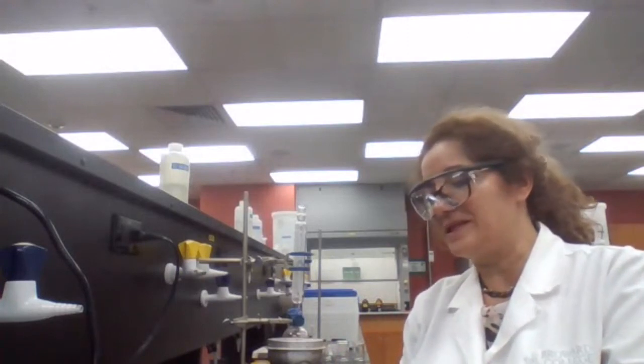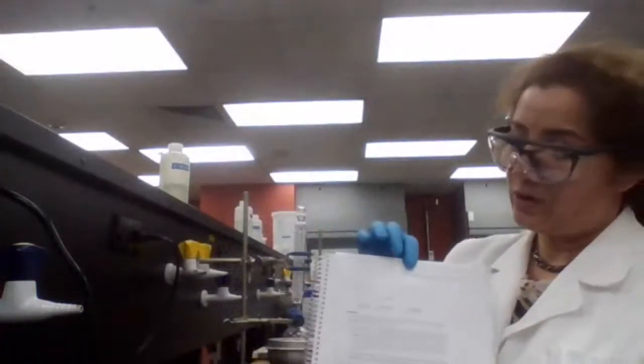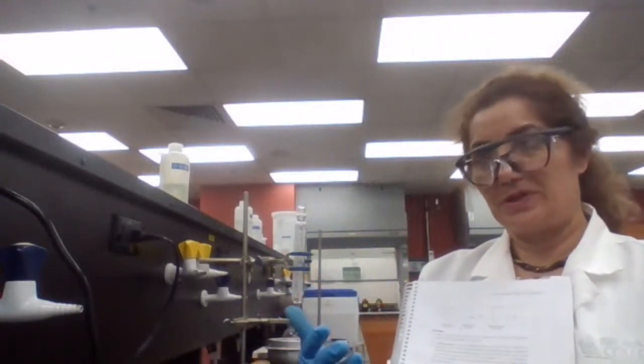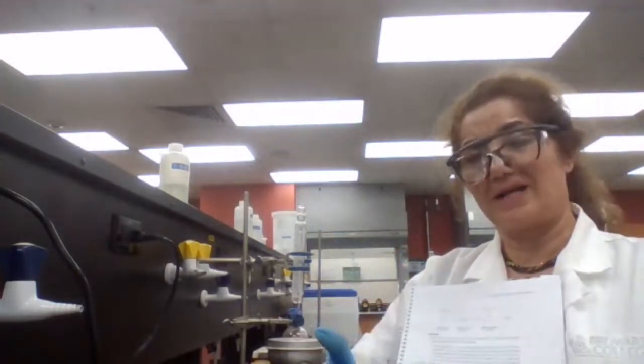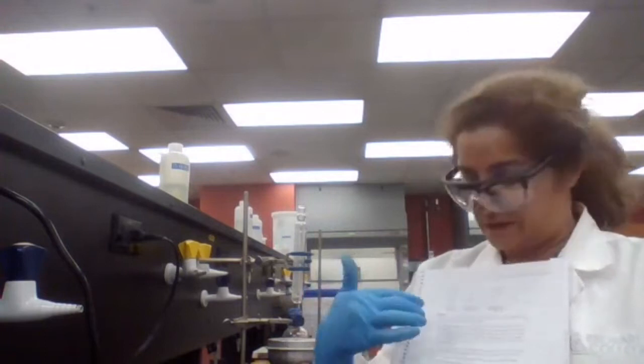So the application of this experiment is very significant in the food industry and at home, but the product that you are getting must be purified. So you have a chemical reaction that you're basing your procedure on. When you write the procedure, your procedure should include the limiting reactant and excess compound, because if you don't have excess compound, especially if the reaction reaches equilibrium, the yield of the reaction is going to be very low, and you don't want low yield of the reaction.